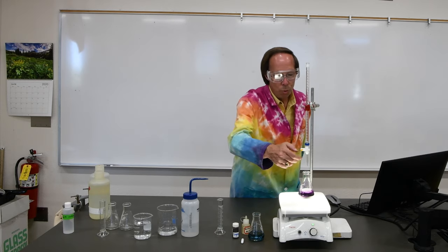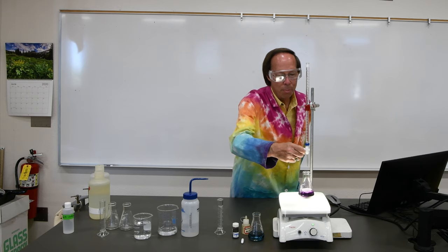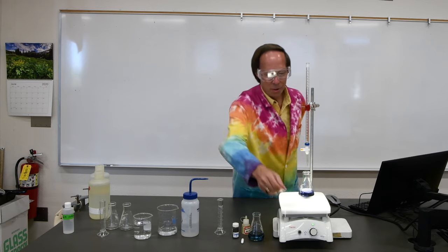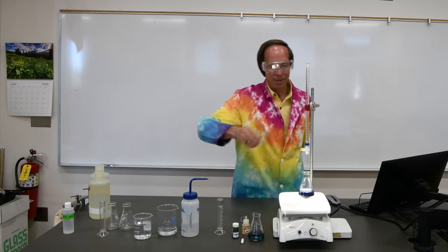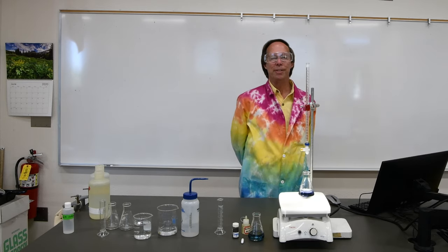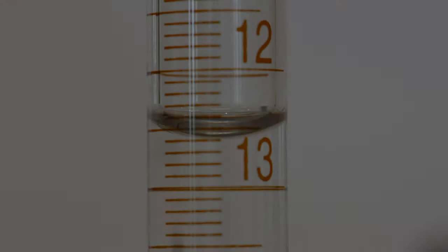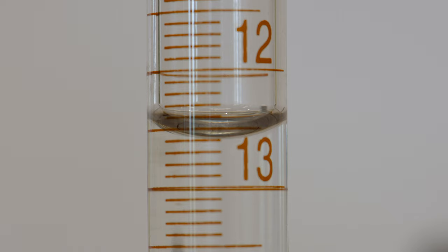Looks like we're going to need one additional drop here. That ought to do it. And there it is. We have that lovely blue color. So that will be the end of our second titration. And this is the final burette reading for our second titration of our standard calcium carbonate solution.